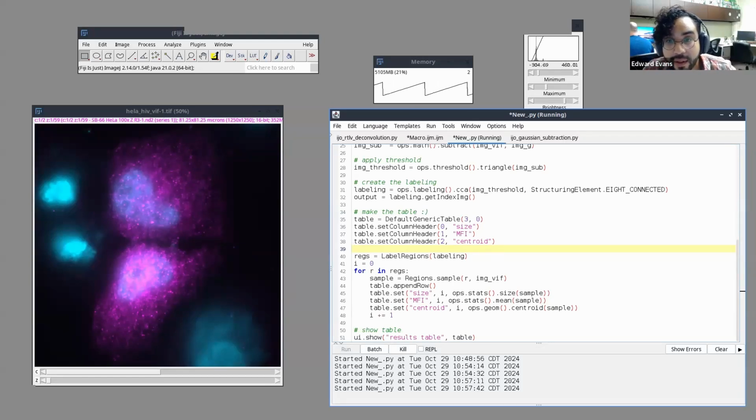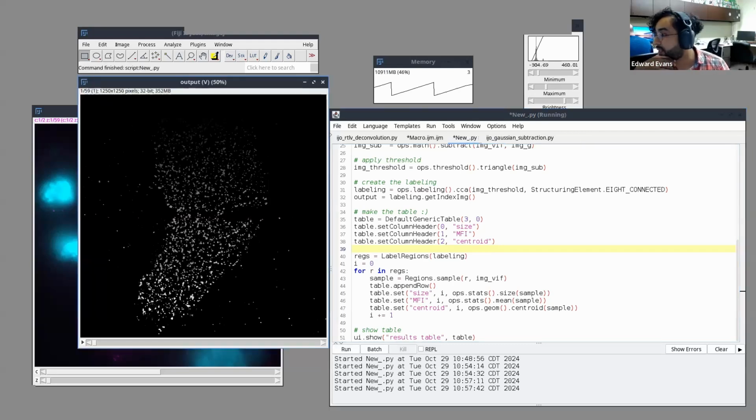Oh, I have a question. Have you ever improved a macro in addition to combining several macros? Yeah, absolutely. You can absolutely write multiple macros and combine them into really sophisticated workflows, or go to the forum, forum.image.sc, and look at what other people have done.